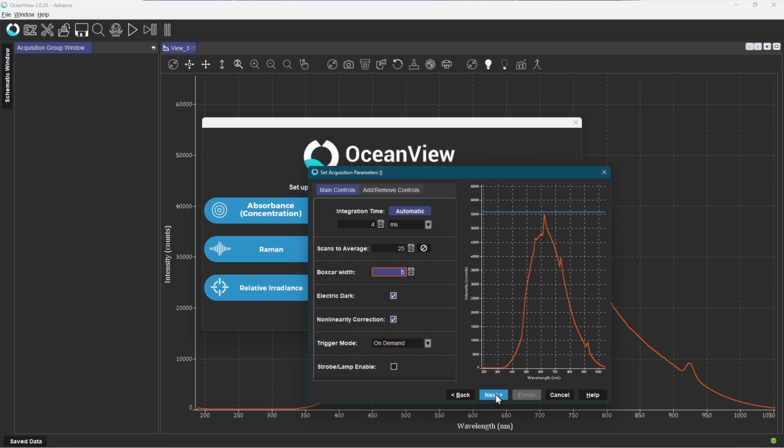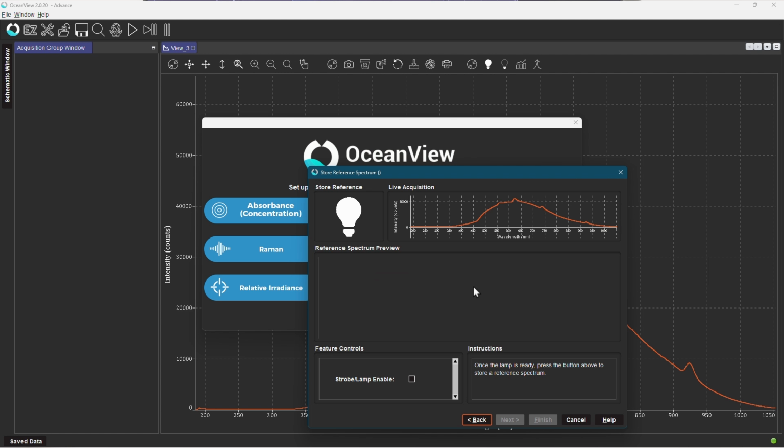In this case, for most transmission measurements, you're doing air as the reference measurement. So another reference that I could potentially use, for my optical filters, I could take a substrate that's not coated, and I could use that as my transmission reference to get rid of the impact of the substrate. But since I don't have a clear substrate to use, I'm going to use air. So a lot of transmission measurements are just done with a reference to air, which is what we're doing here.